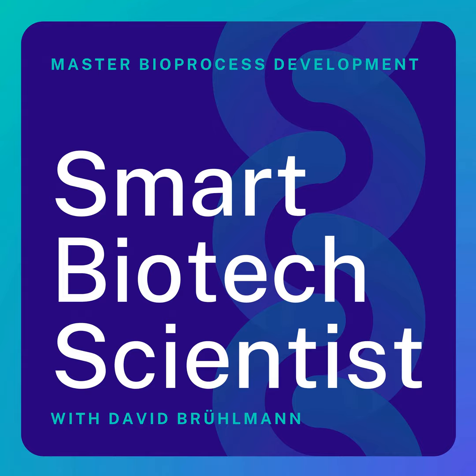And then finally, the high throughput platforms. The pros are that this is where you get massive parallelism. We're talking about dozens of experiments all in parallel, and you get advanced process control, even at the micro scale, with real-time, non-invasive measurement for things like optical density, pH, dissolved oxygen, different fluorescent proteins. They are reproducible and generate tons of rich data for DOE studies, for example, really speeding up early stage optimization.